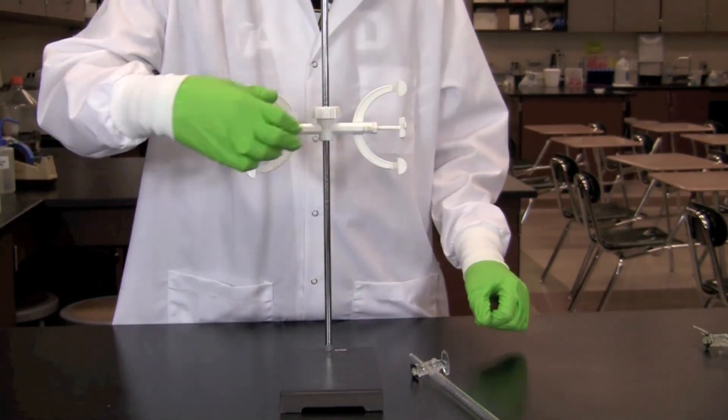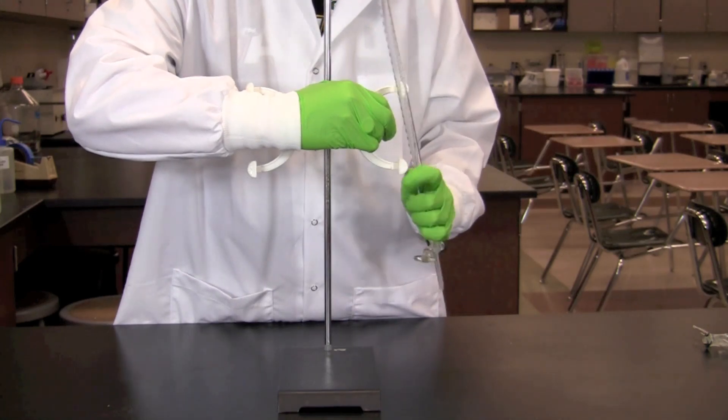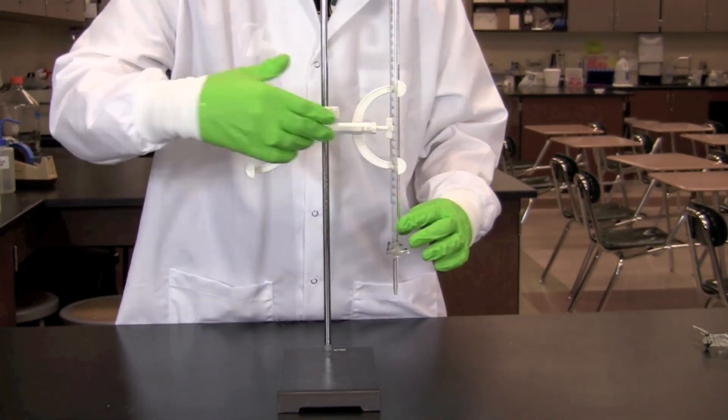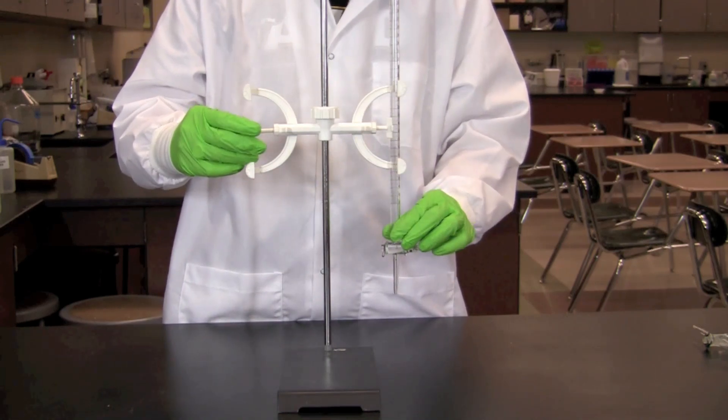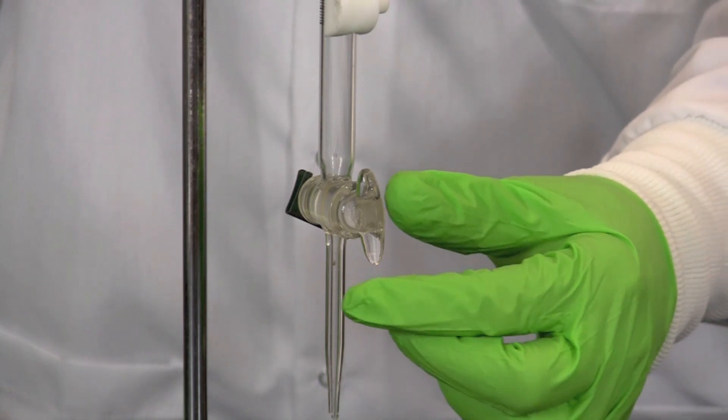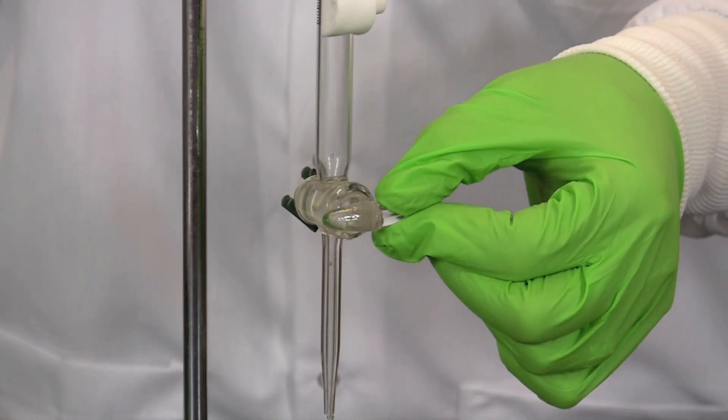First, set up the titration apparatus. Clamp the burette into a stand so that it is vertical with the stopcock at the bottom. Make certain the stopcock is in the closed position. It is closed when it is turned perpendicular to the burette.